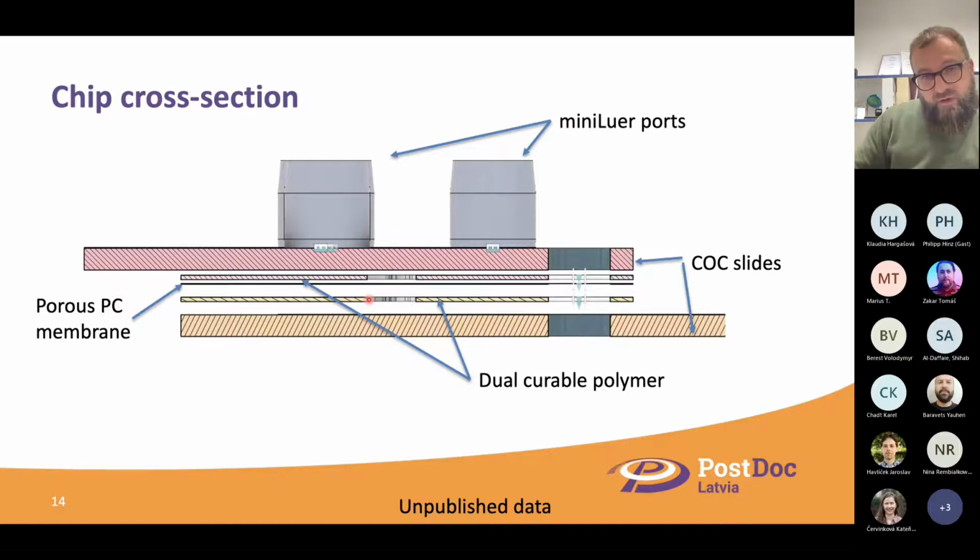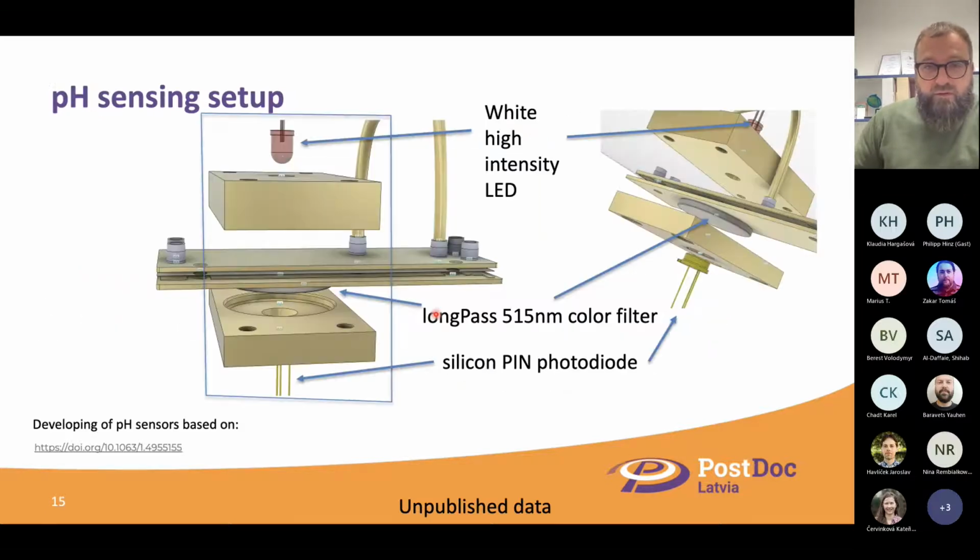And here you can see a chamber. It's quite a small chamber, but it's quite enough for our cells. But still, of course, growing the cells is a big challenge for us and for whoever is developing such kinds of chips, because you need to understand how the cells are growing there.